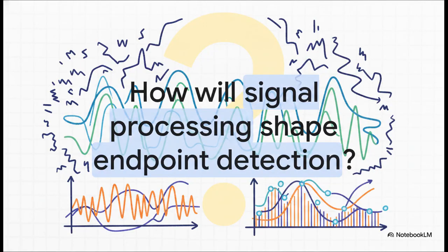But the science isn't perfectly resolved just yet. Taking derivatives inherently amplifies any electrical noise you might have in your signal. As researchers are quick to point out, hunting for that perfect second derivative zero crossing can actually cause meters to jump around erratically right near the endpoint because of all that amplified noise.